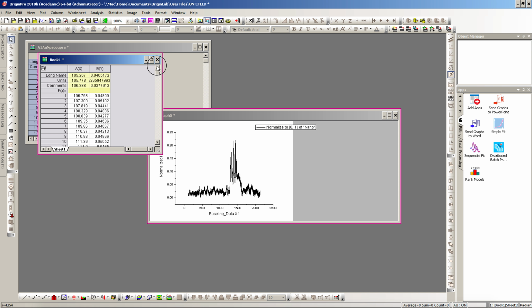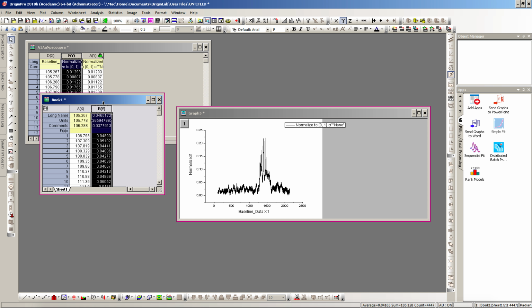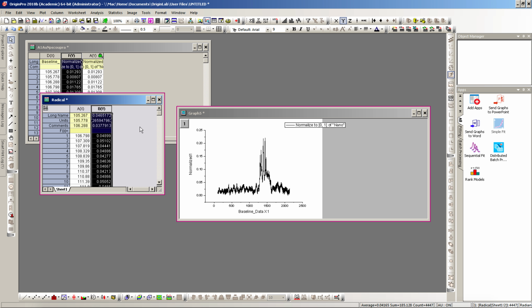There were some that it took because I wanted it. Okay, I think it will survive. You see these values that I didn't take correctly. It doesn't matter because those values are very small and there's nothing there in this reading. Okay, very important to name things properly. So this is radical. Very important. All the time, at all levels, you must label things properly.